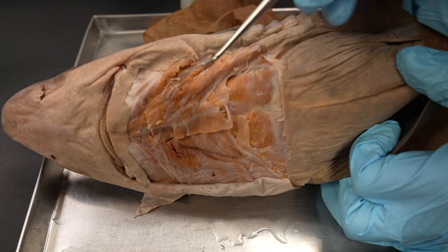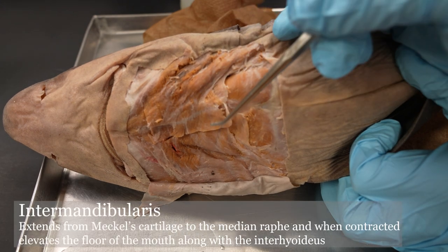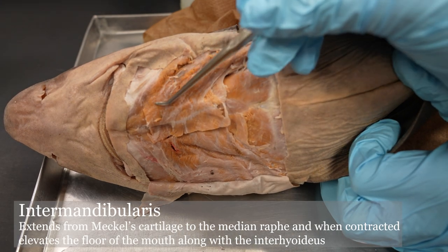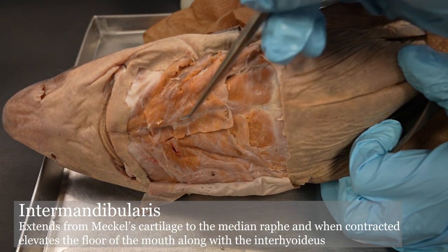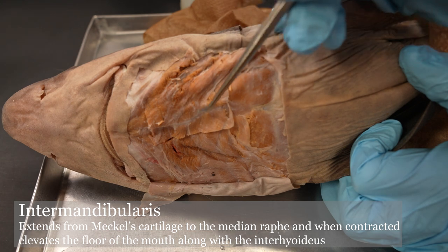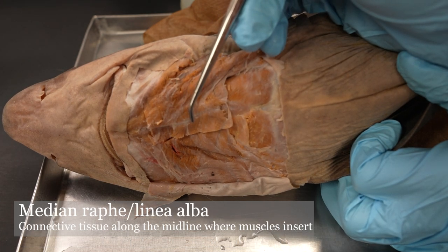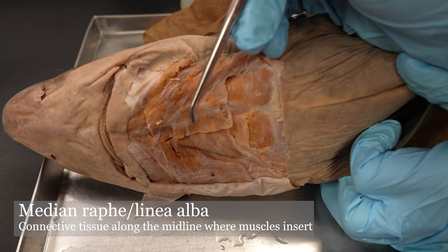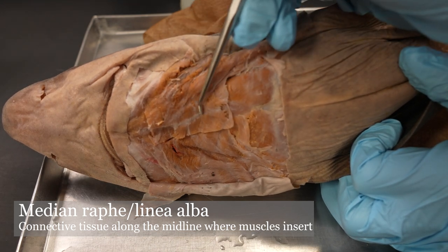The first thing we'll look at is the intermandibularis. It's a little torn up in this one, but it is this large sheet of muscle. You can see a dividing line that is the median raphe — or 'raffi' — I'm actually not quite sure how to pronounce that, or the linea alba, which is another term for that.